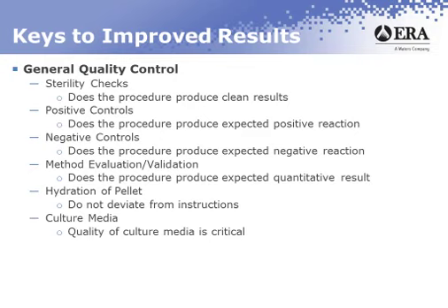Proportions. Make absolutely sure that if you're supposed to weigh out a certain number of grams to a certain volume, follow it very, very closely. If you start deviating from it, you're basically creating conditions that are going to be different for you than they are for other participants in the study or the folks that analyze the QC sample.